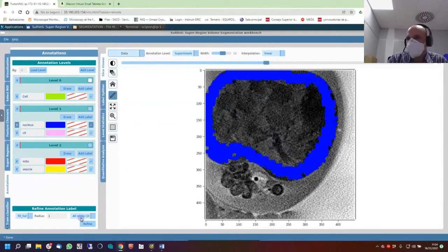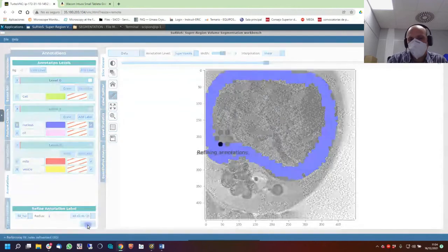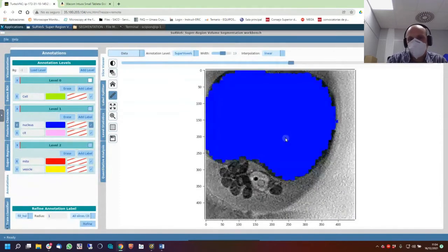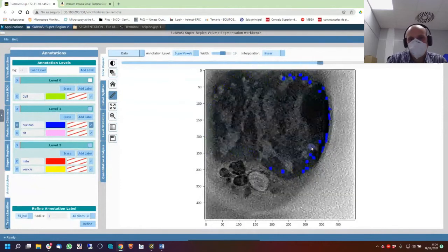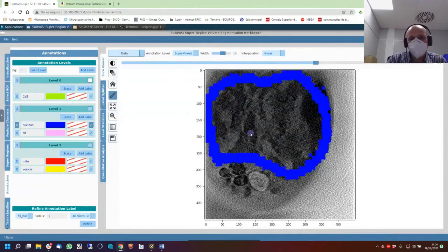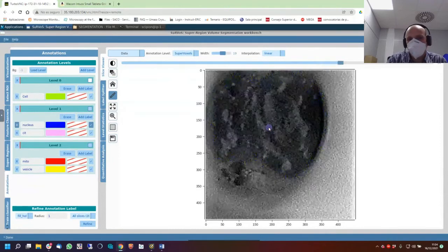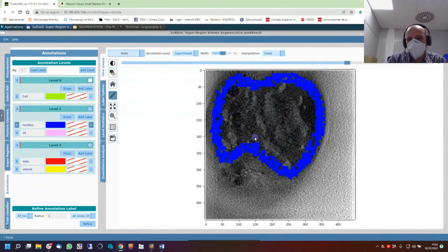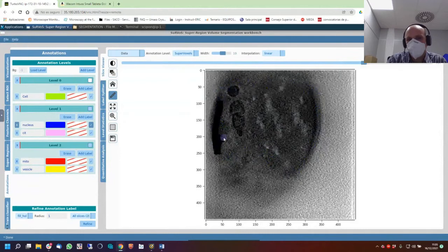See it? If there are some problems or some question, just tell me. I want to show you the next, and then I will give you free time to go for the next. Here you see that the nucleus should be here. There are 2 mitochondria here, like a carrot.